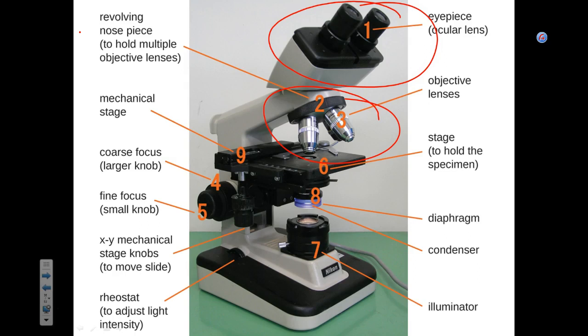One more consideration which I will remind you about: when you put oil on the slide, avoid bubbles at any cost. Bubbles will mess up the picture, okay? What I do sometimes, I squeeze some oil, put it on a piece of paper so all the bubbles are in that first drop, and then I move on.